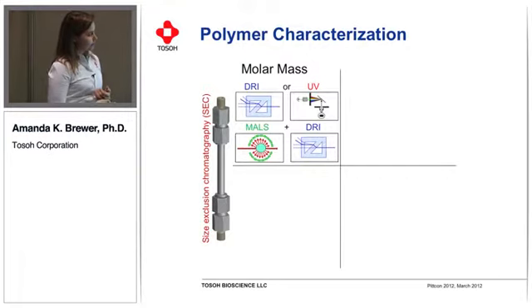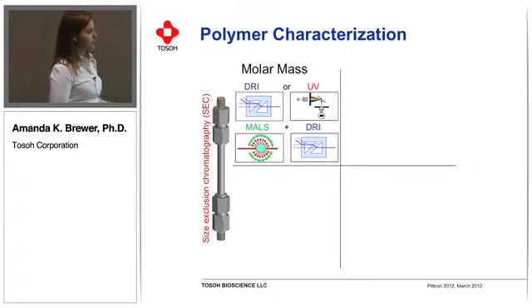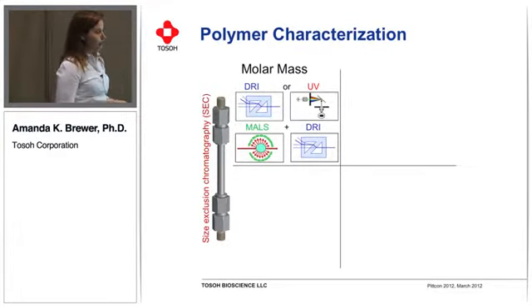And like I said, this is the multi-angular light scattering detector. It can have anywhere from 2, 3, 7, or 18 angles, which are the ones typically used. And it measures the intensity of scattered light at those angles. And from there, each slice eluting from your chromatography column is matched up with the concentration at that given slice, and you obtain an absolute molar mass of your sample.